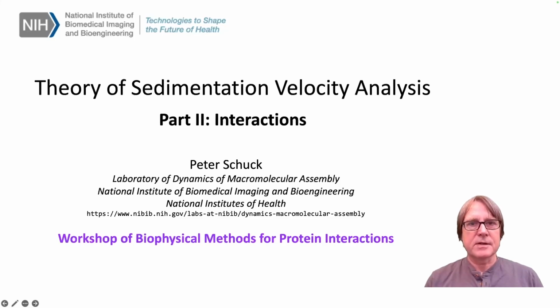Welcome to our video on sedimentation velocity of interacting macromolecules. The material stems from our workshop Biophysical Tools for Studying Protein Interactions, which we held annually at the National Institutes of Health and hosted by various research institutions. But we wanted to make this lecture more widely available and spread the word of how sedimentation velocity works and how to apply it, because it's really a very powerful tool to study protein interactions in solution.